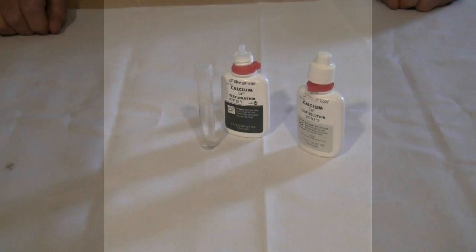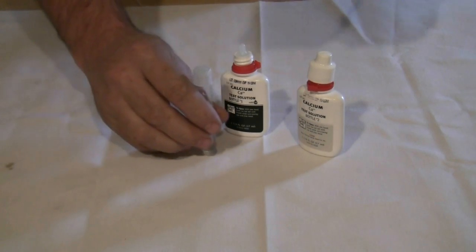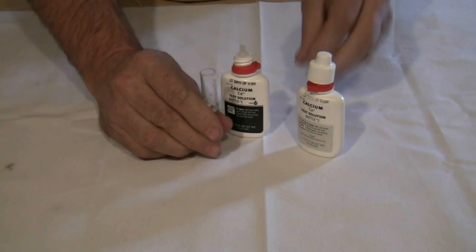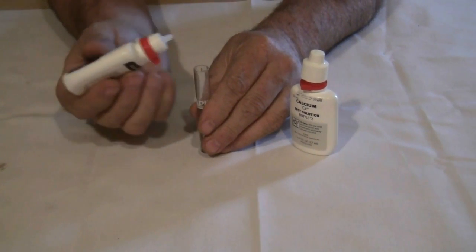We're going to test for calcium using a drop test. A drop test consists of placing a designated number of drops of a test solution into a sample of water. Read the manufacturer's instructions as to how many drops of solution are required for your test kit. In this case we are to put in ten drops of solution number one.